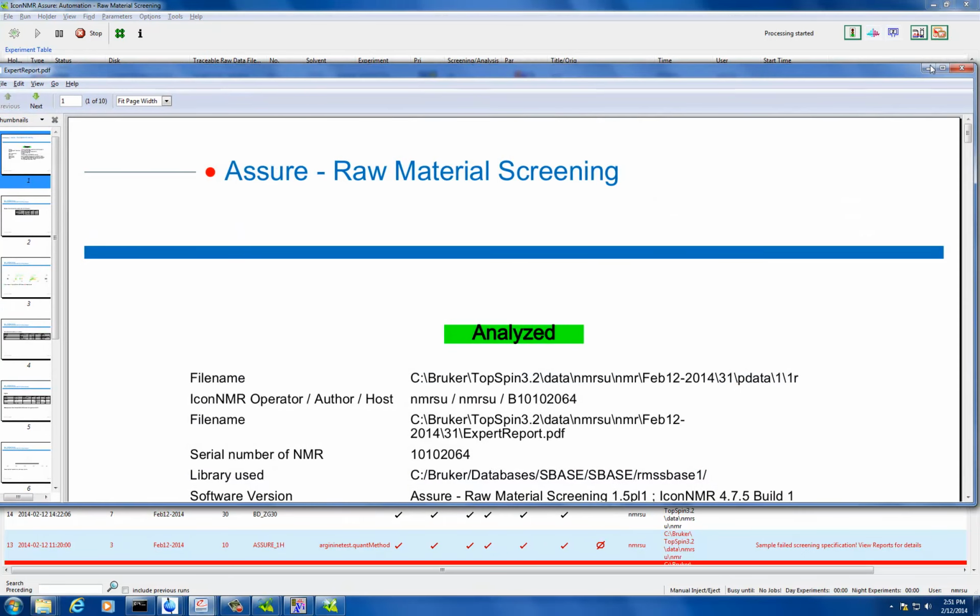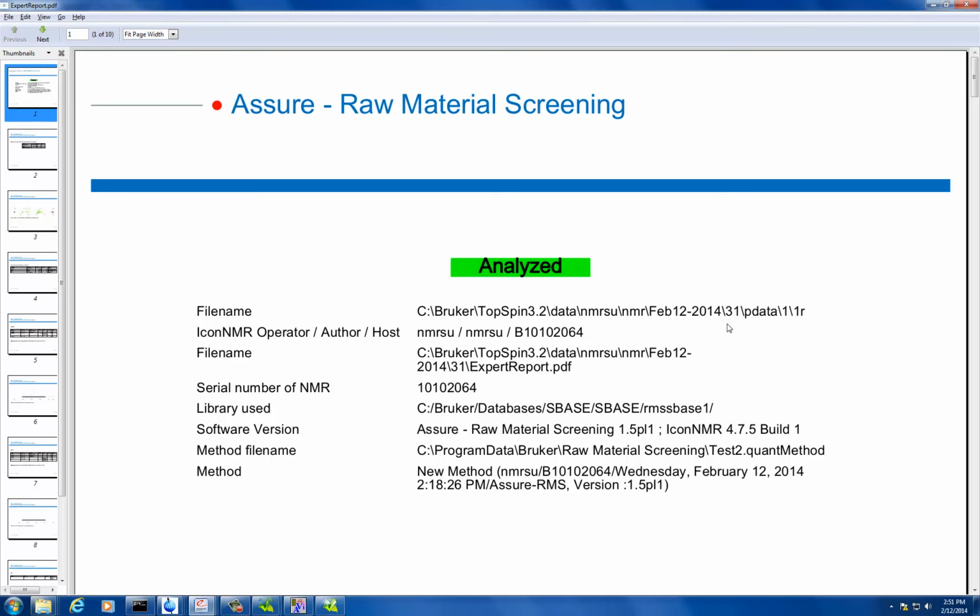Here I have, for example, an arginine sample that's pure arginine, and this was done in Switzerland and it's sealed. If you make a reference standard, you can seal the tip of it and then see how long it lasts. You guys need to make one, whatever that might be.